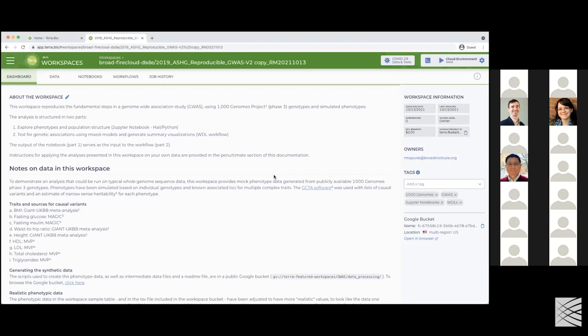This session is more just to get you hands-on with what it's like to launch a cloud environment so that you could do this analysis. But if you wanted to come back to this later, I very much encourage you to do so. Okay, so your workspace should now be cloned.